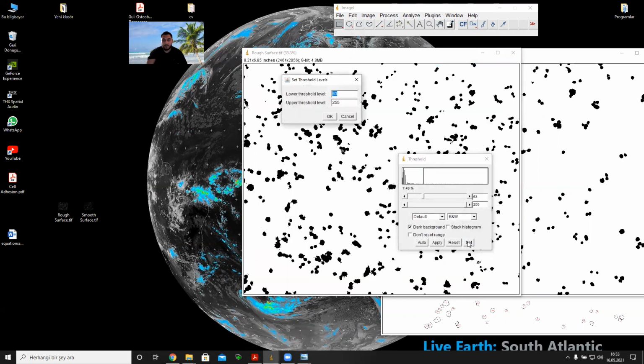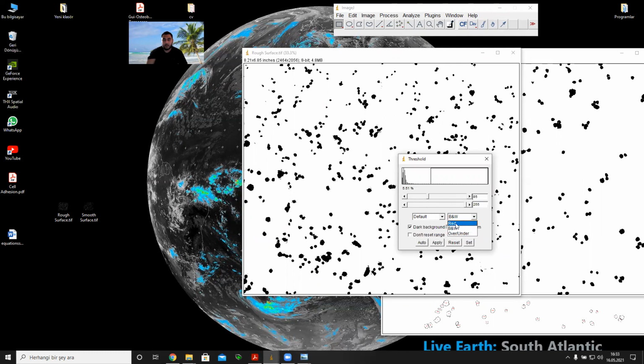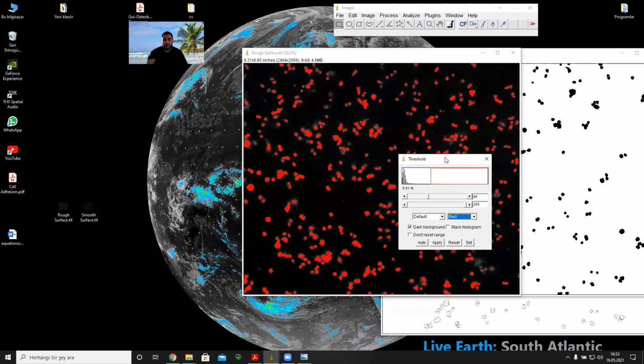This time I'm going to use 85 as a low threshold level. Of course, before recording the video, I made some practice, and this is, I think, the more ideal case. And now it's okay. It is cool. Let me use red colors.